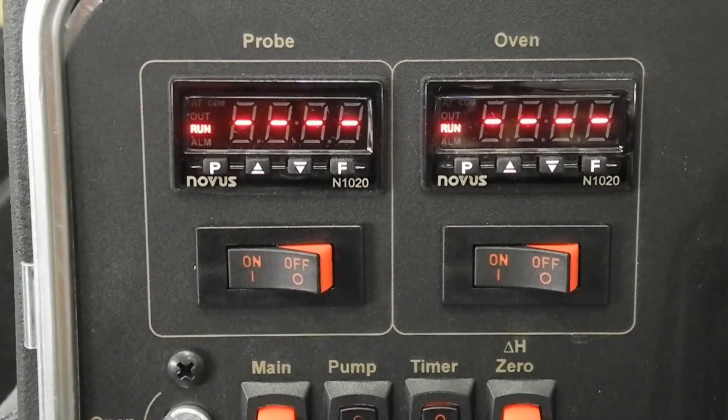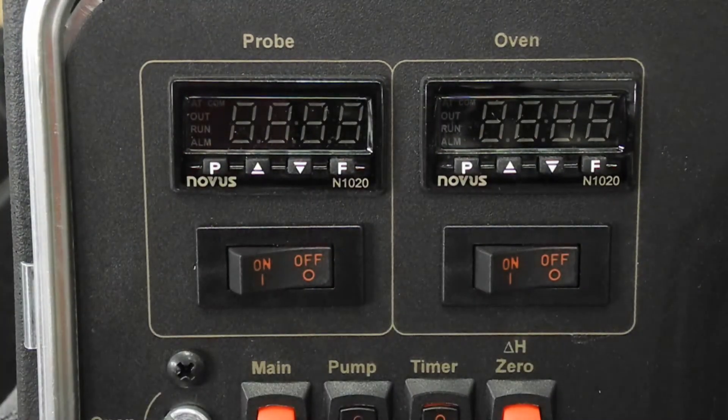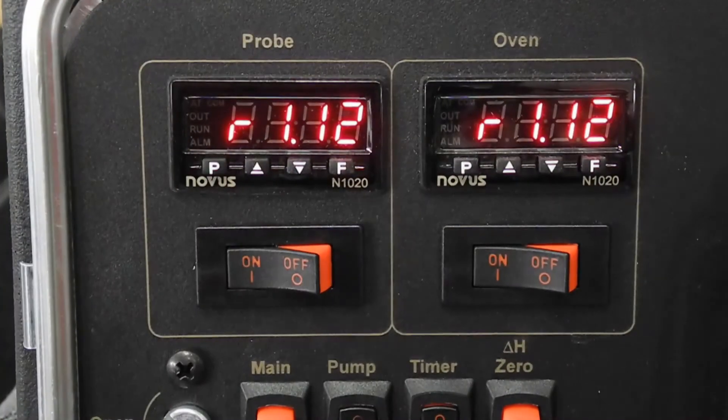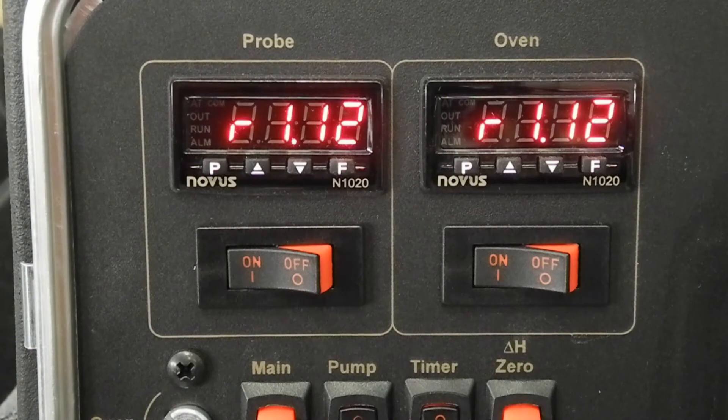Wait 30 seconds for the parameters to take effect. Power the console down for 30 seconds and then back on again. The temperature controller and the console are ready to be used.